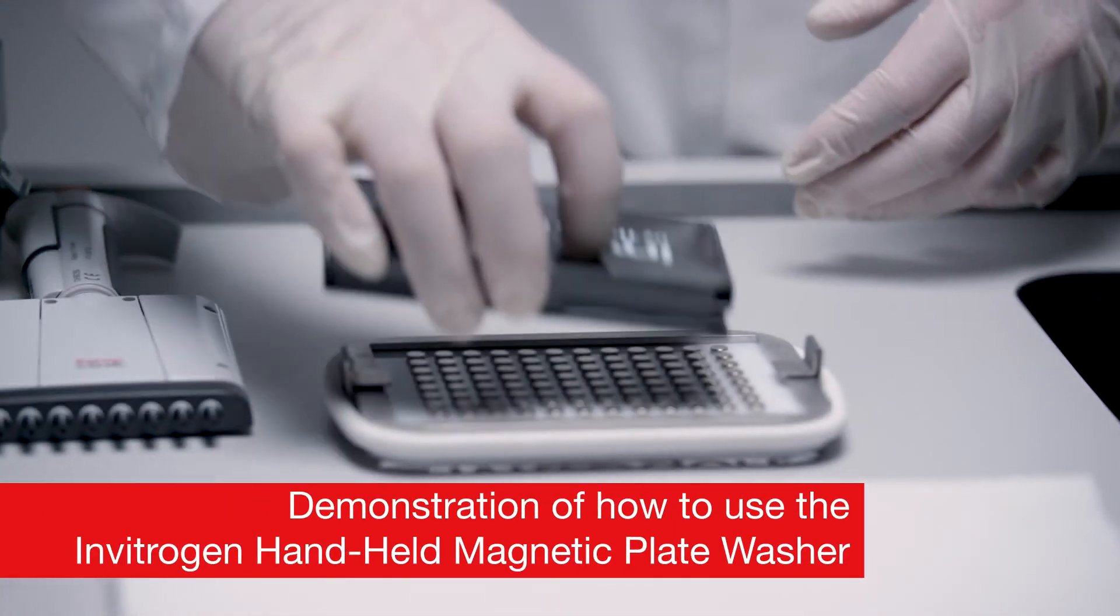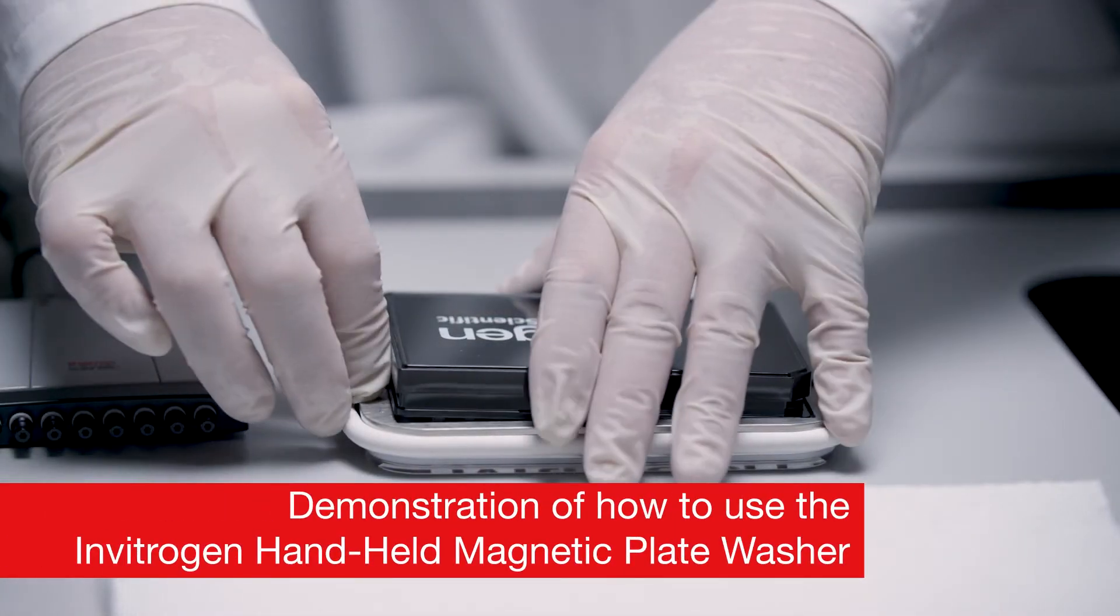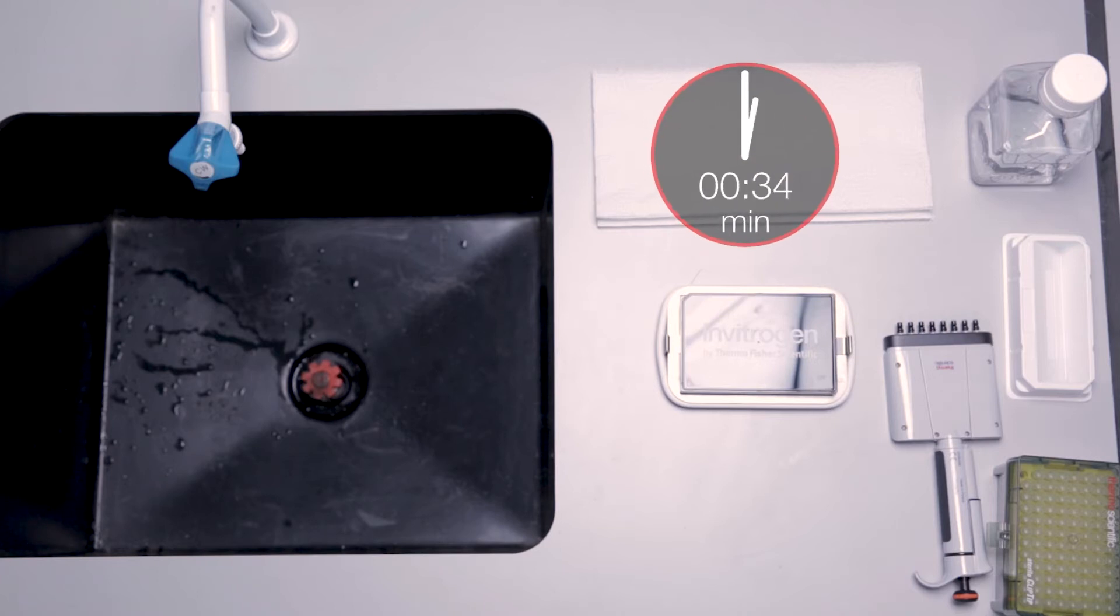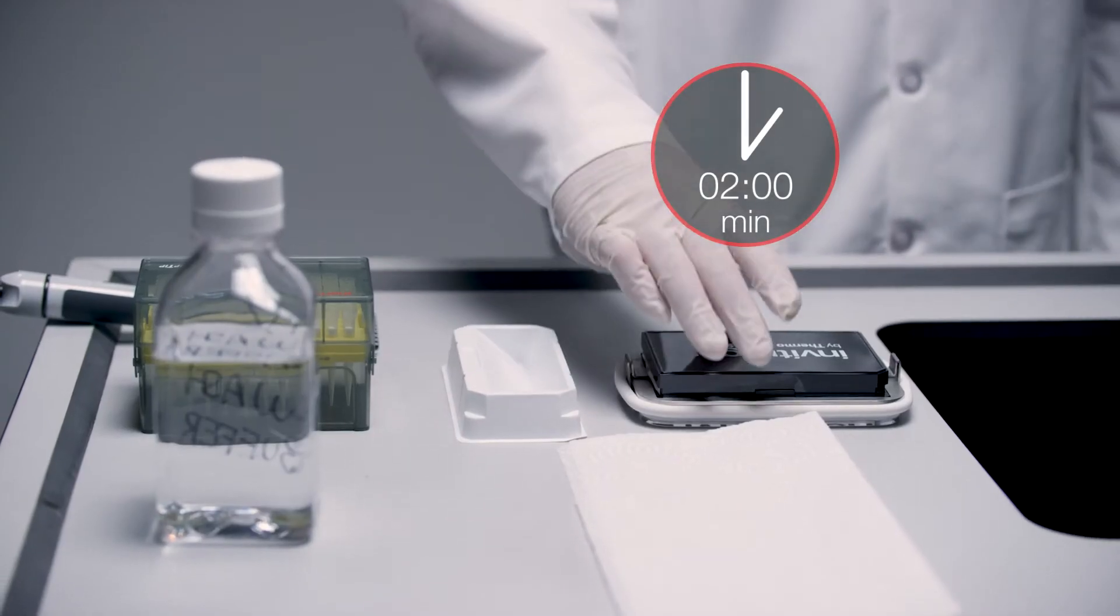Securely insert the 96-well flat bottom plate into the handheld magnetic plate washer. Ensure that the plate is held in place by the two tabs and wait two minutes to allow the beads to settle on the bottom of each well.